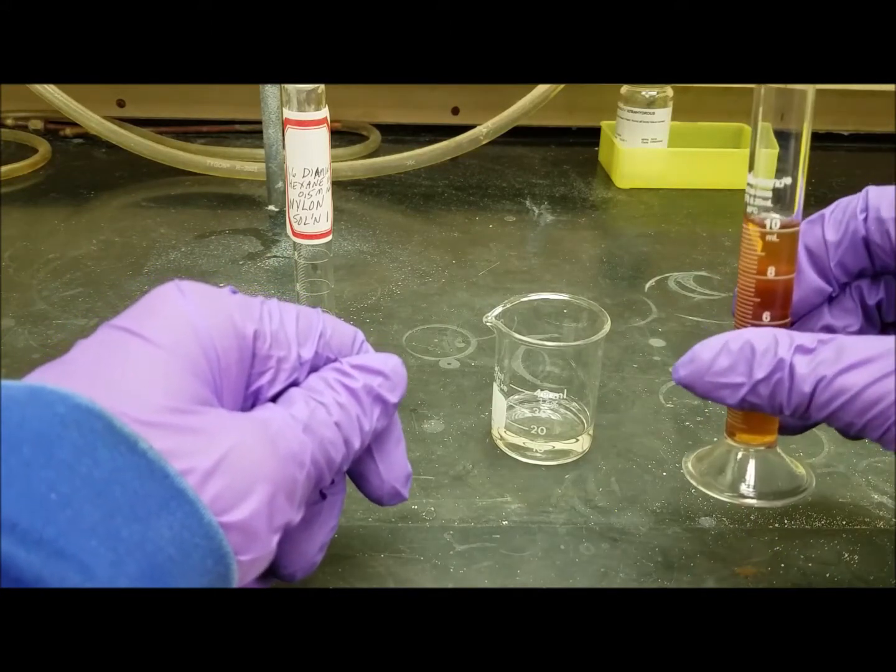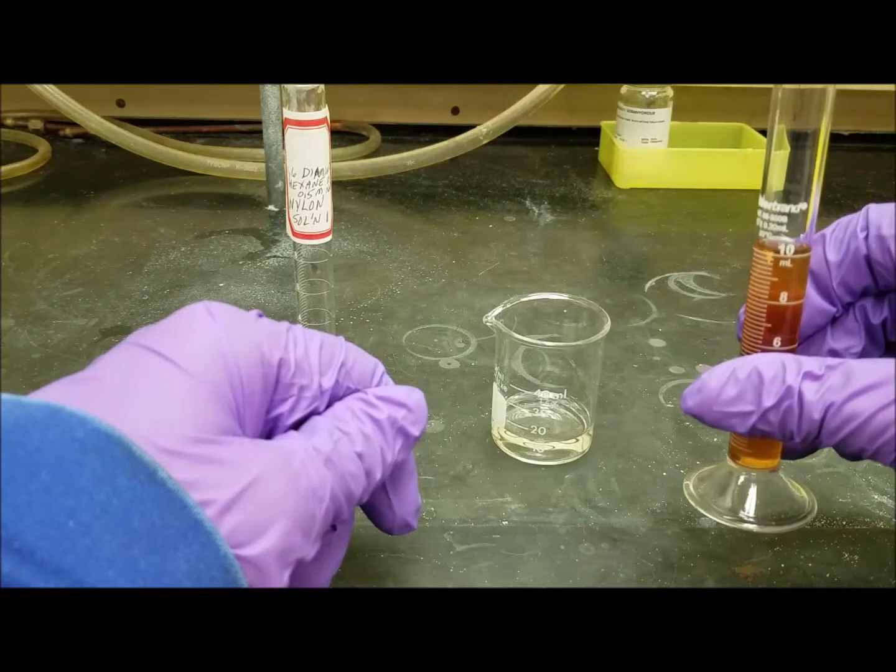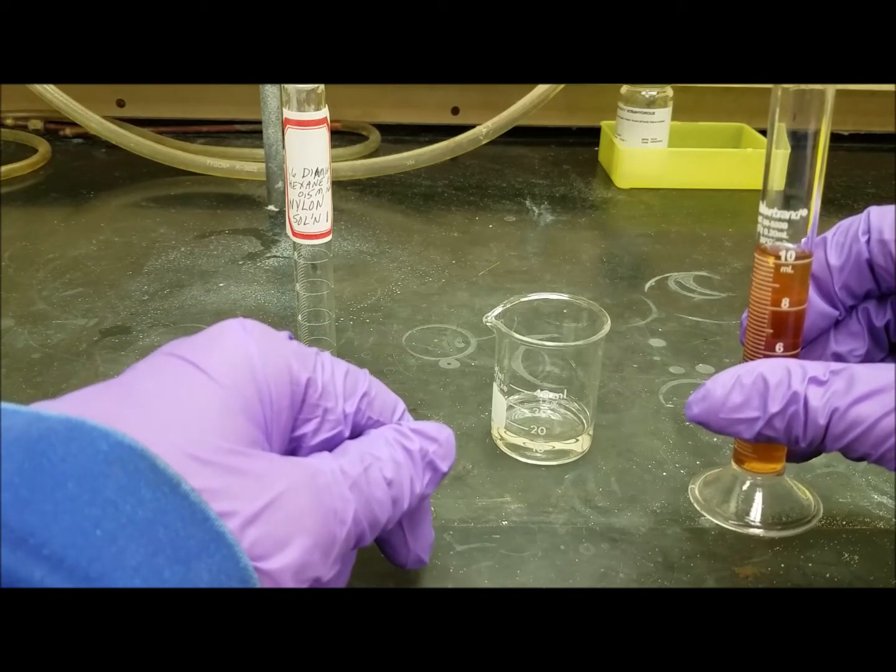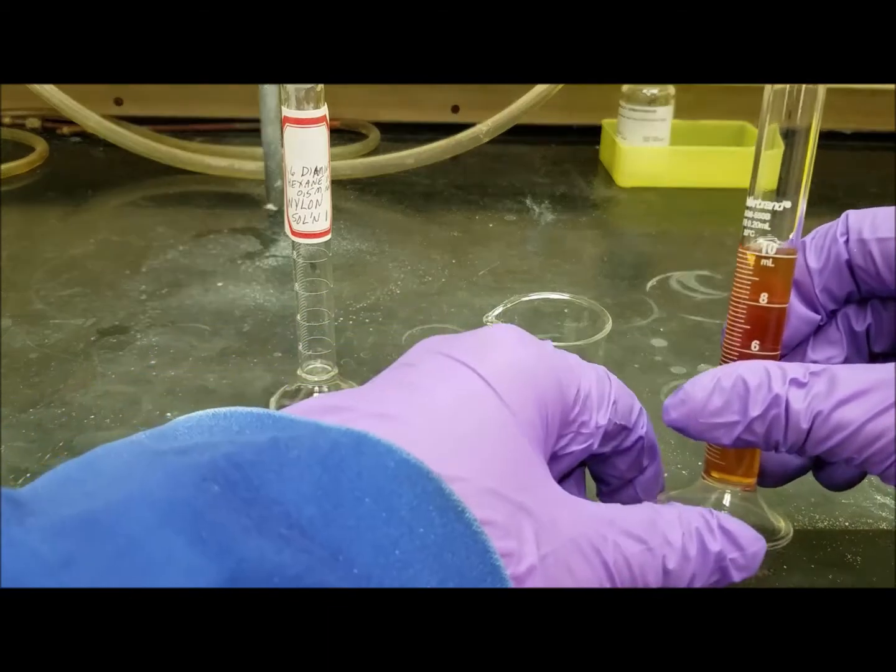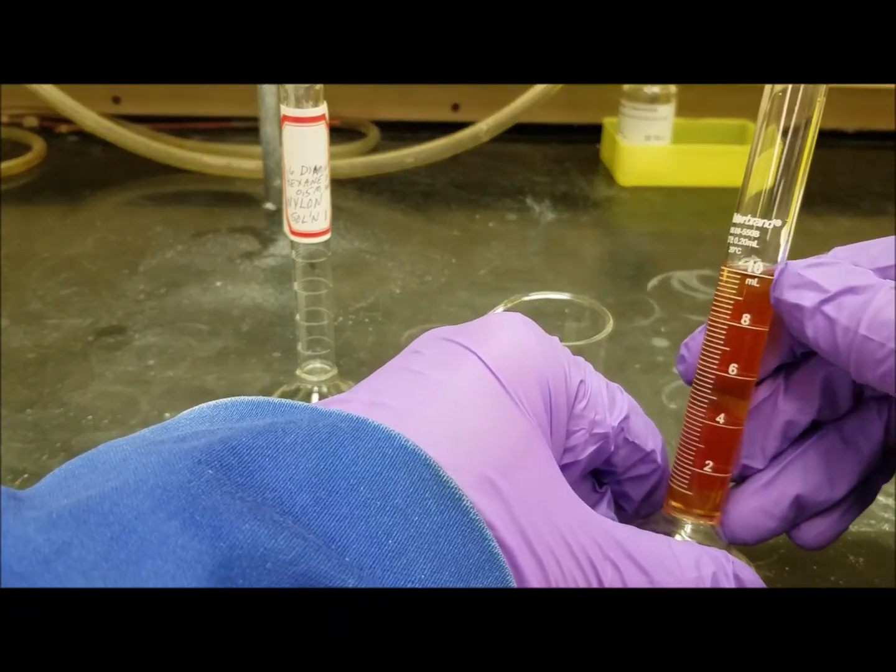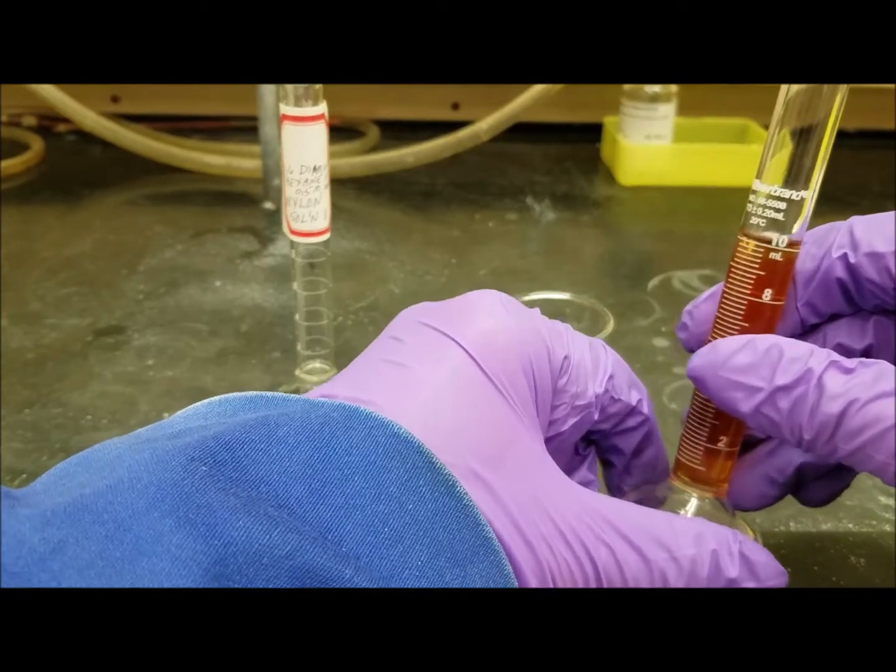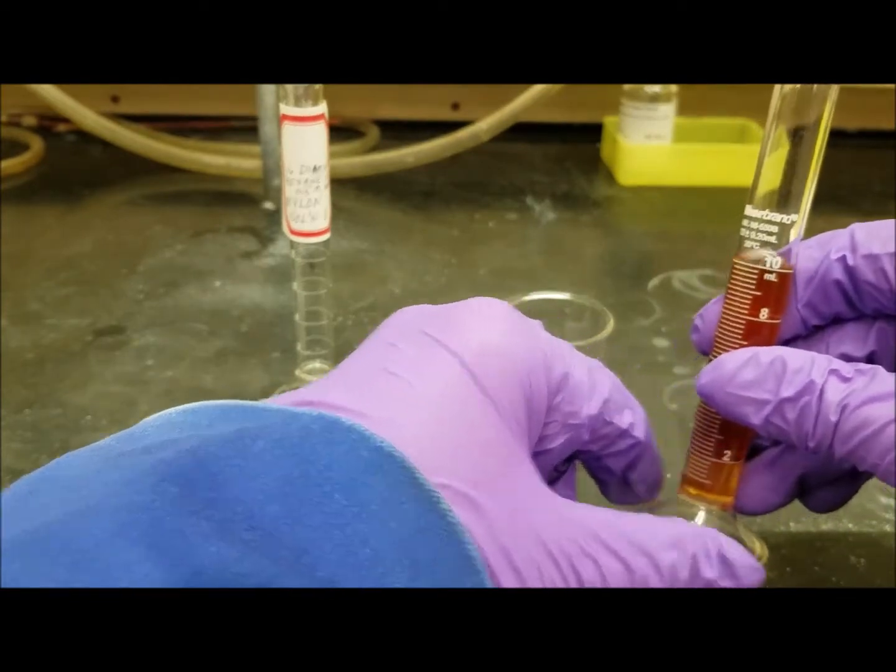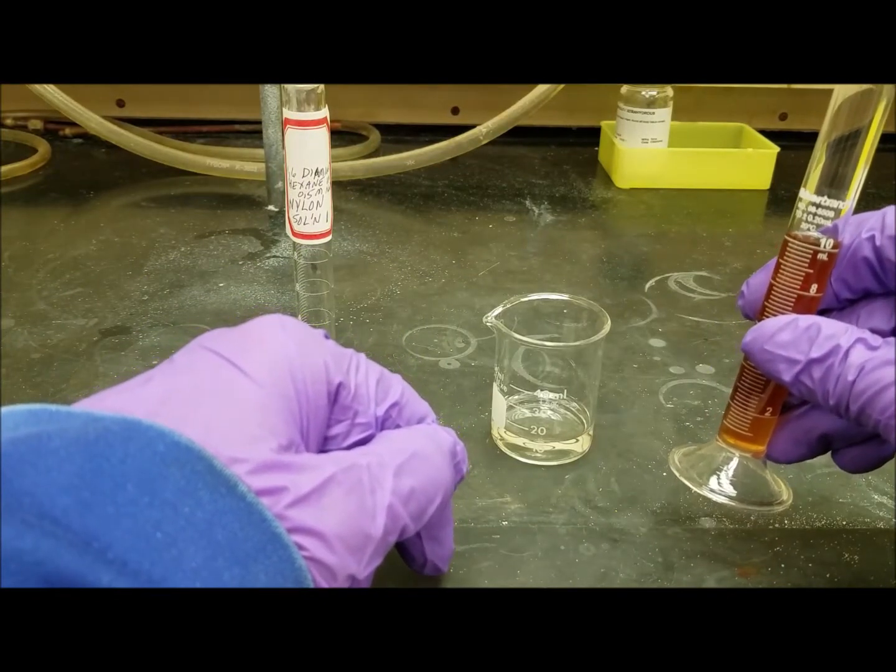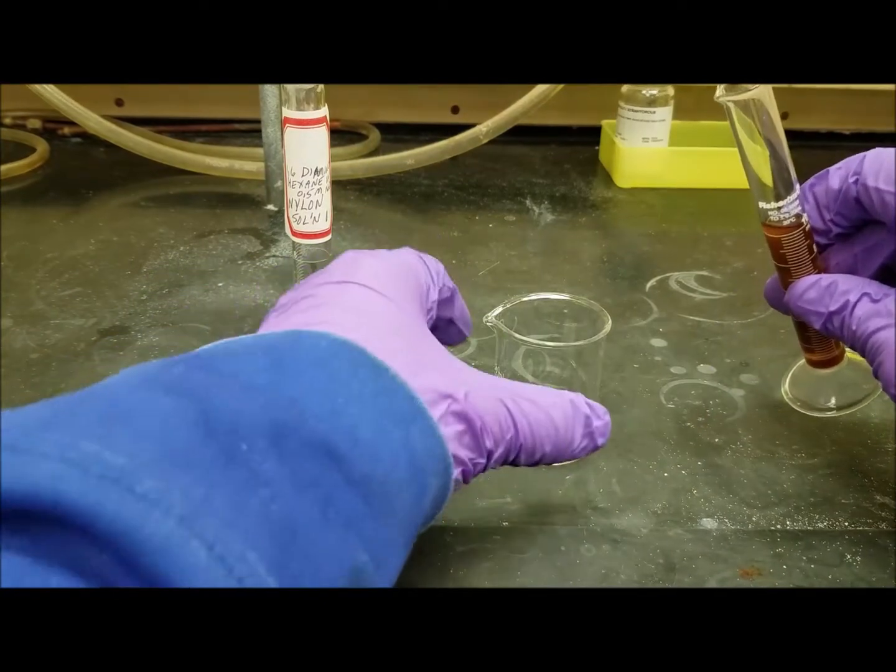And here, this is a solution of adipoil chloride. So this is a six-member carbon chain with acid chlorides on the other end. And acid chlorides react with amines. But this is dissolved in cyclohexane. Cyclohexane and water don't mix, kind of like oil and water.